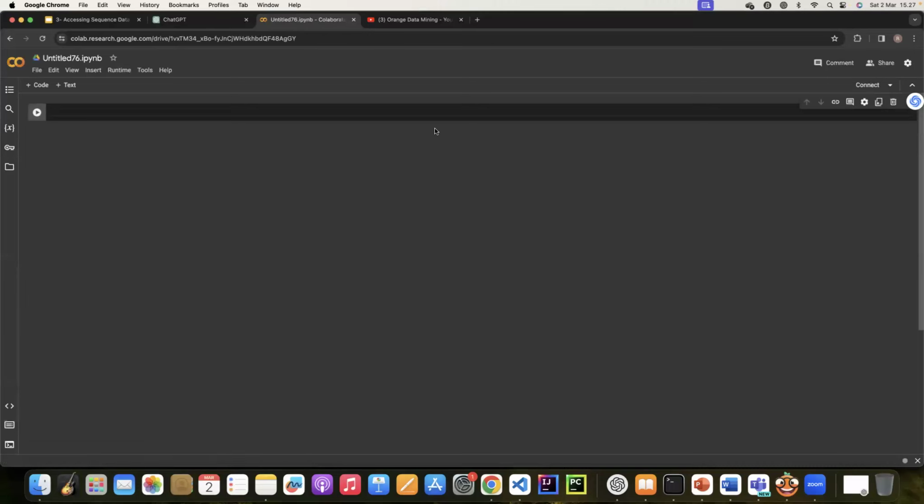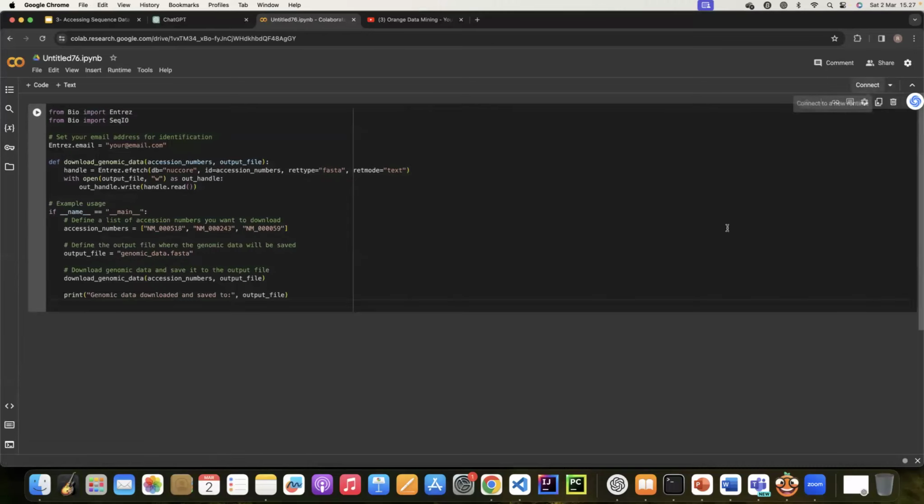And once you download, you can use it in Terra Bio, or if you can download in the cloud, that is better, because you don't have to put it on your laptop in case the file is too big.